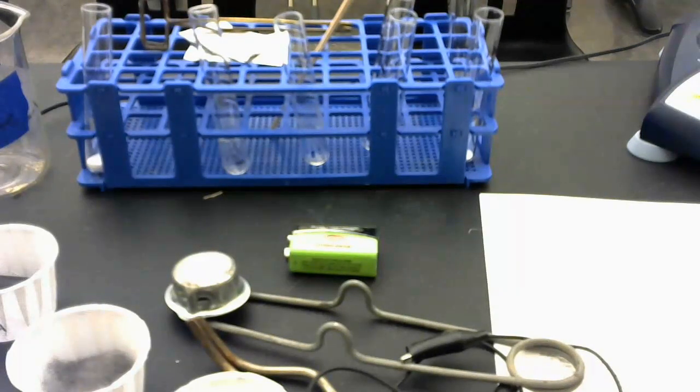Okay, some general procedures for you. Each lab station has been set up with the materials for you. Carry out the reactions using the appropriate quantities and reagents suggested unless otherwise stated. When heating reagents and test flame, you must make sure that your test tube opening is pointed away from other students. Heat the test tube at the surface of the material and work downward towards the bottom.